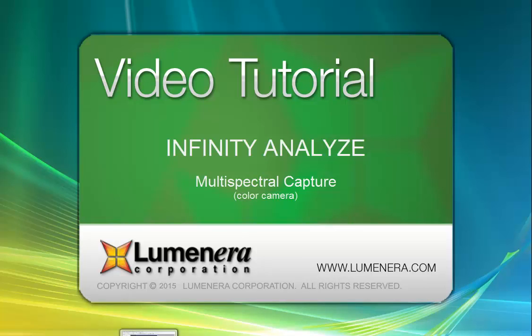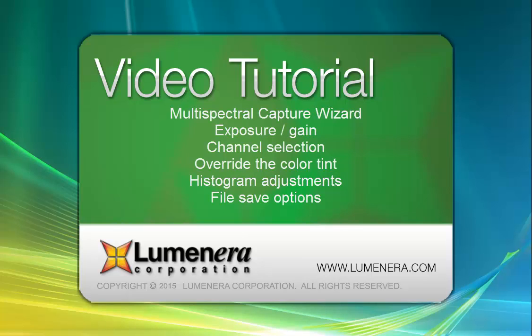This is part of the Infinity Analyze video tutorial series. In this tutorial, we're taking a look at the Multispectral Capture utility. With Multispectral Capture, we have the ability to adjust the settings for exposure and gain and to capture images using the different fluorescence filter cubes and to produce a composite result. We'll go through the steps and the sequence on how to do that.